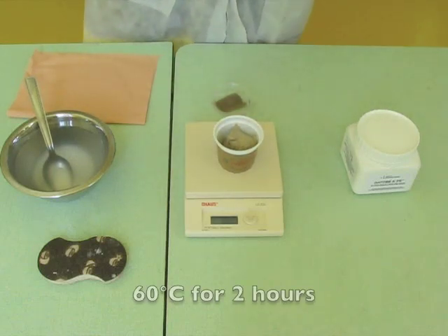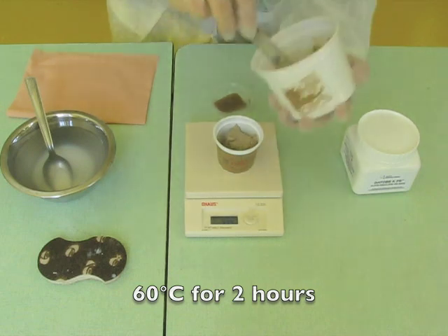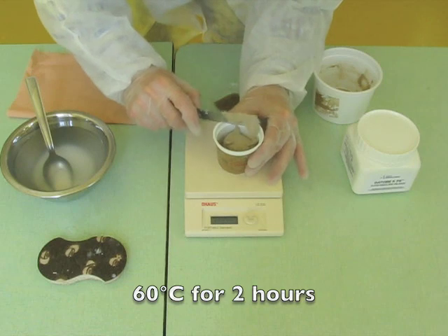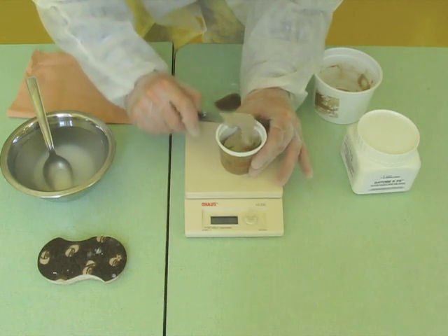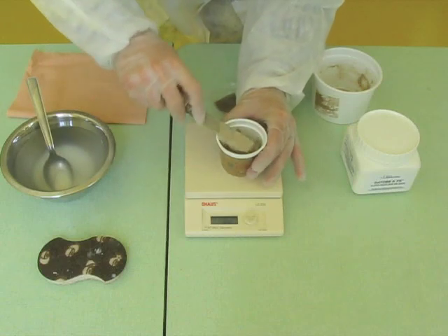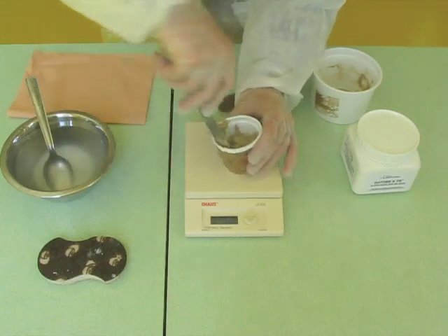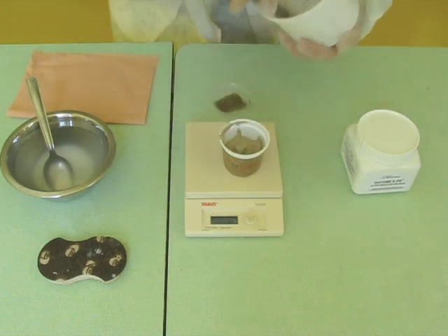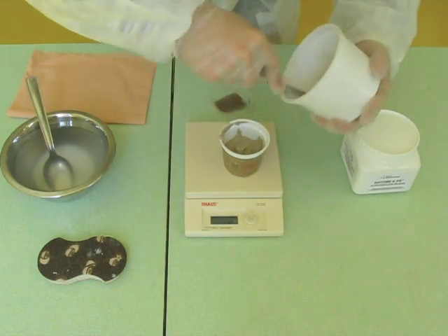Once finished, place the sample in an oven at 60 degrees C for 2 hours. Attention! The Dottobi geopolymeric reaction is exothermal. It means that the mold must withstand a temperature higher than 110 degrees C. You will understand why at the end of this tutorial.